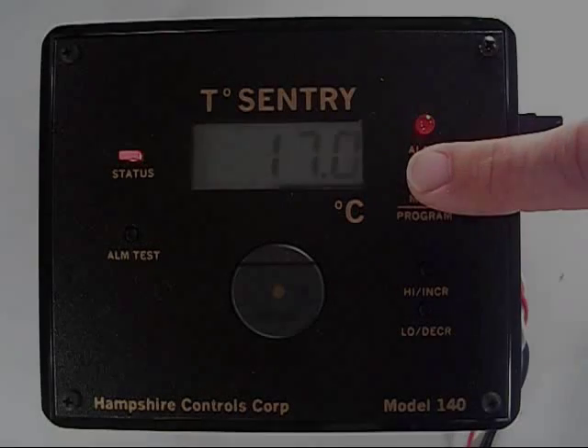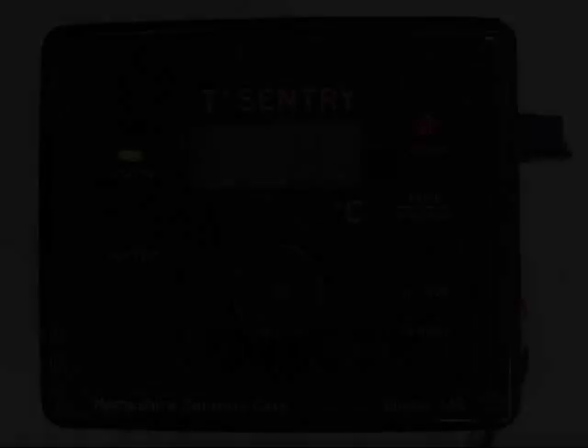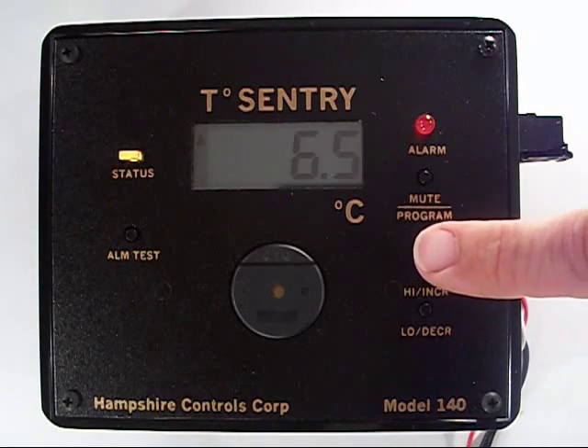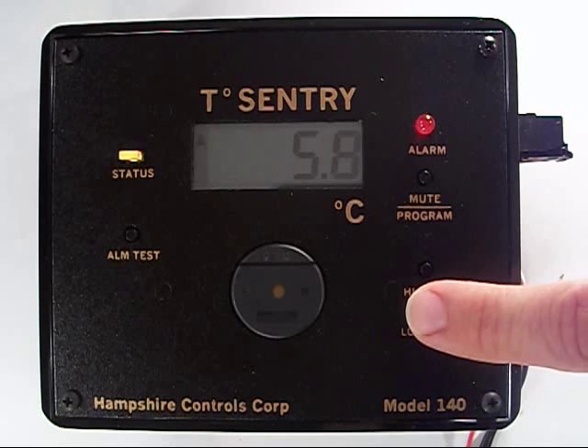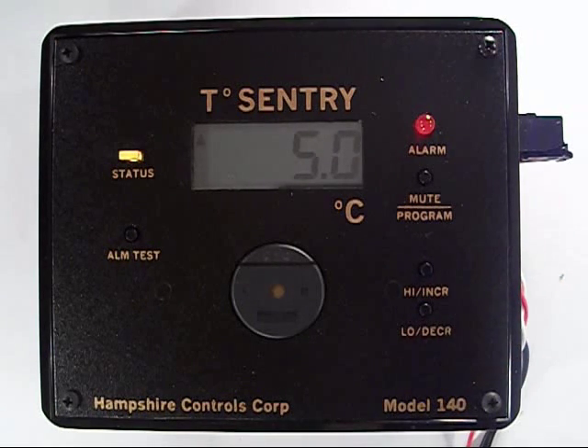High temperature. Hold down the mute program button for a few seconds. You'll see HI for high. Set it using your increase and decrease buttons. I'm going to set this for 5 degrees centigrade. If my probe senses temperatures at or above 5 degrees after the initial alarm delay period, which is 5 minutes, the alarm will be triggered.